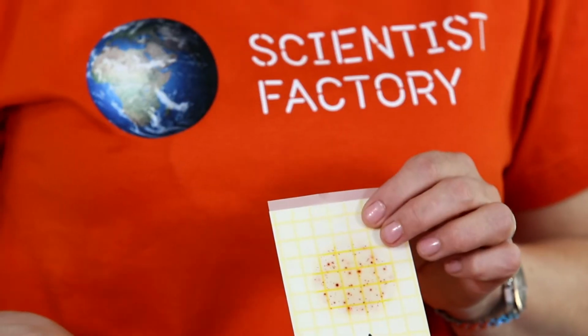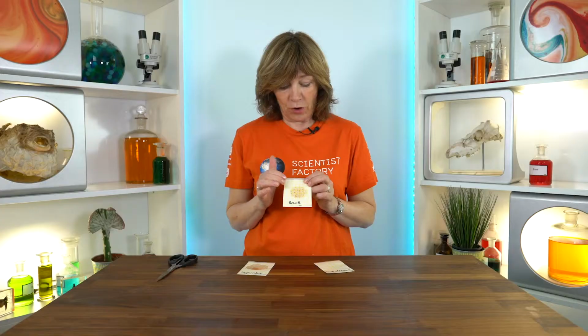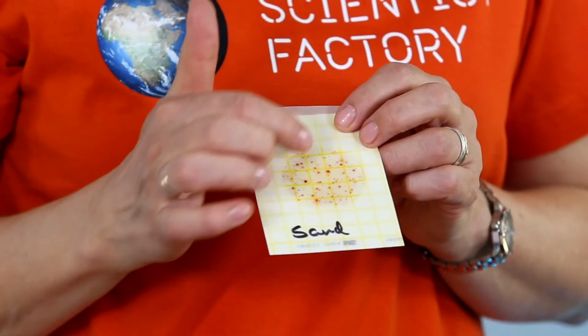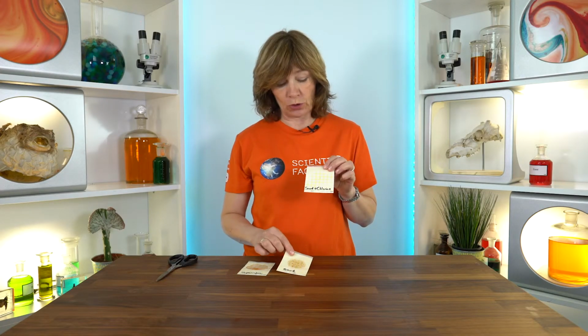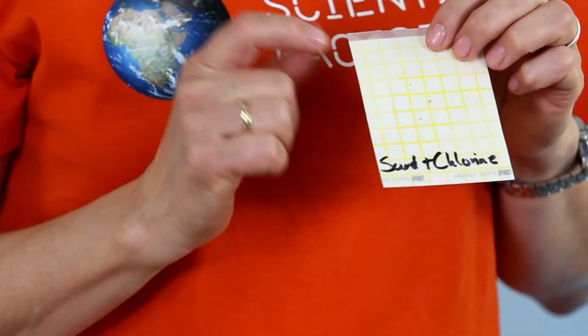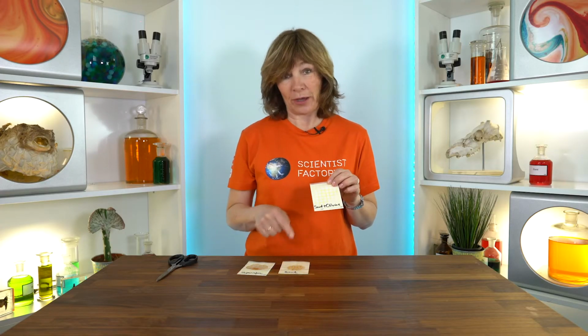After this water was purified through sand, however, there are far fewer colonies, and these colonies have really grown to a much bigger size than these. And then I added a few drops of chlorine, and you can see now I only have 3 colonies. So chlorine really killed a lot of these bacteria.